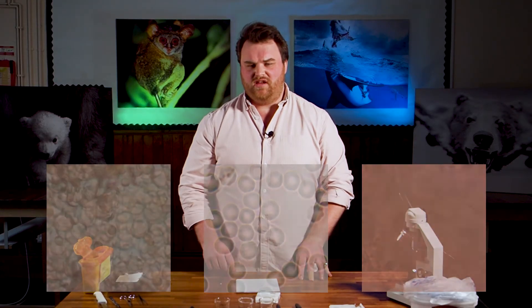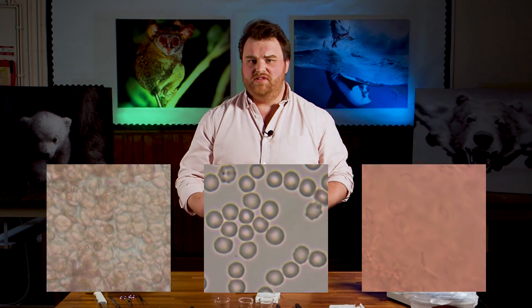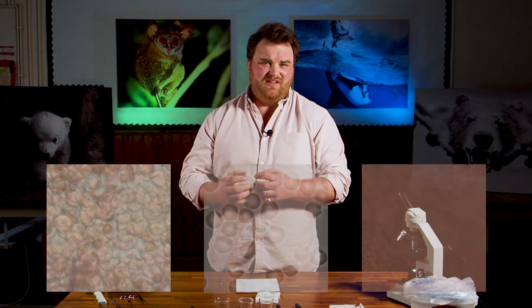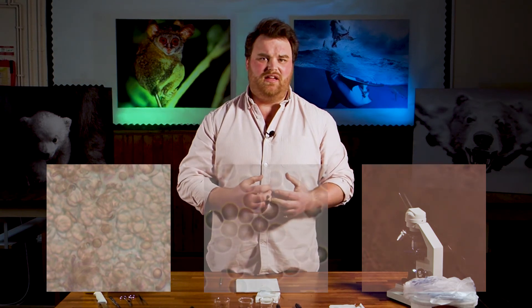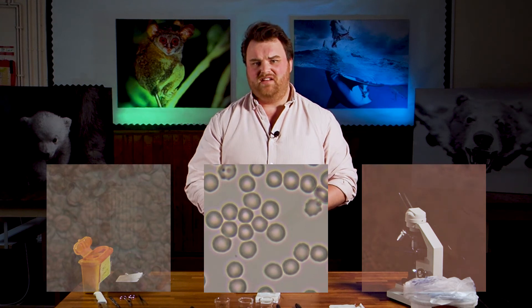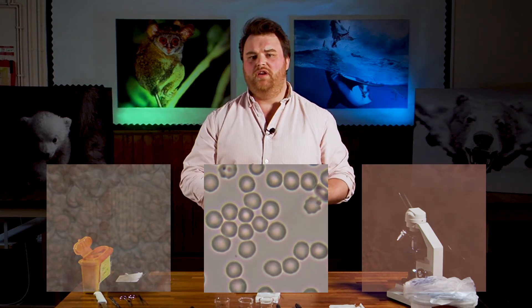We've been recording our slides for about 20 minutes and you can see the changes those cells have undergone. Again you can see the three different reactions based on the different solutions. On one hand we had the concentrated salt solution — you can see the water has left those cells and they've started to shrivel up. In plant cells we call that plasmolysis; in animal cells we call that crenation. In the middle we've got the red blood cells in the 0.85% isotonic solution — those ones are fine, the same concentration as blood plasma, so those cells haven't lost or gained water.